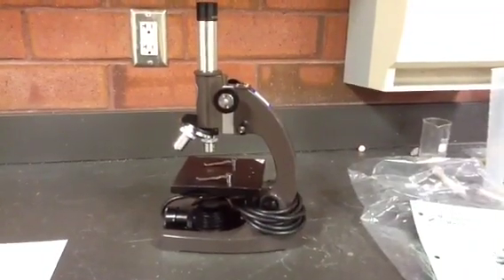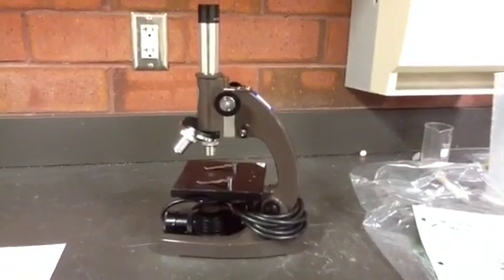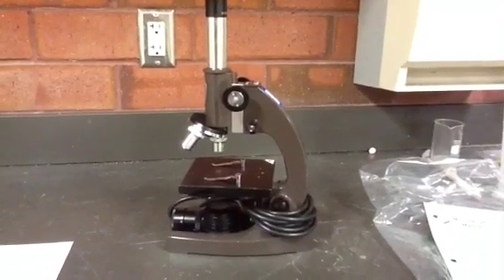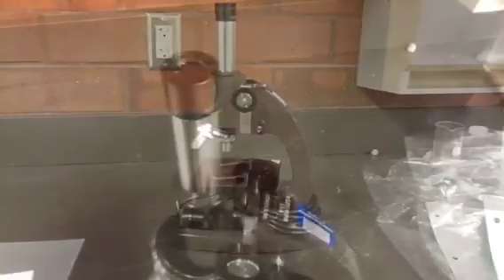Hi everyone! Today we're going to learn how to use a compound light microscope. A microscope is used to look at things that are too small to be seen with your own eyes. Don't confuse that with a telescope, which is used to look at things that are far away. First we're going to look at the parts of the microscope, then we're going to learn how to use it.